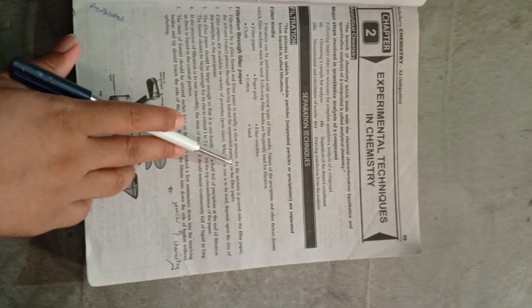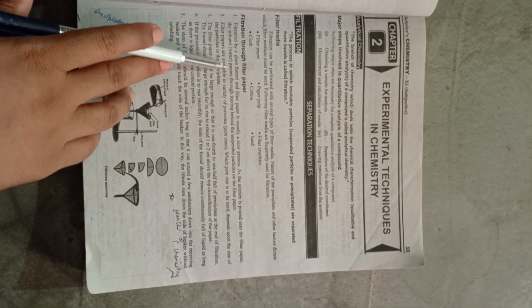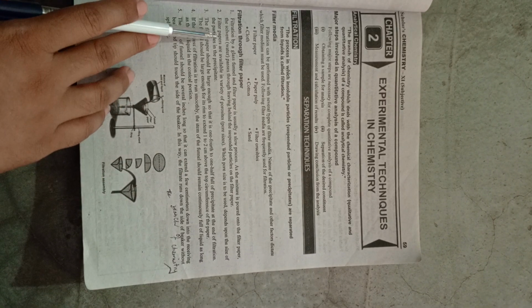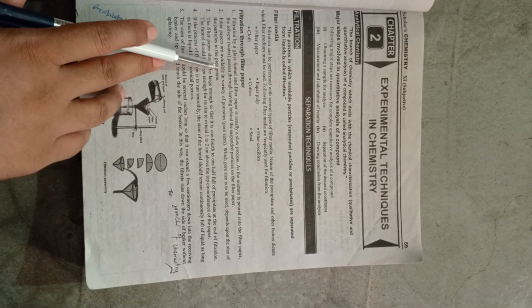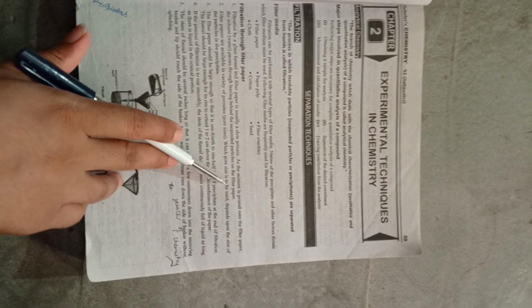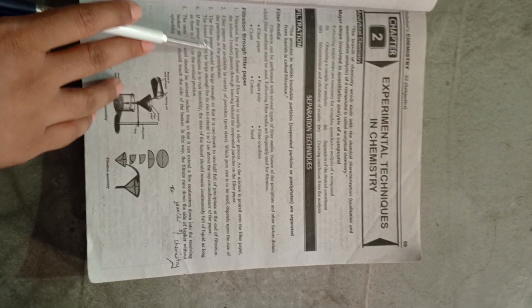Filtration by a glass funnel with filter paper is usually a slow process. As the mixture is poured onto the filter paper, the solvent passes through, leaving behind the suspended particles on the filter paper. Filter papers are available in a variety of pore sizes. Which pore size is to be used depends upon the size of the particles in the precipitate.